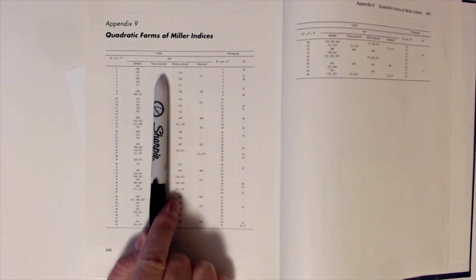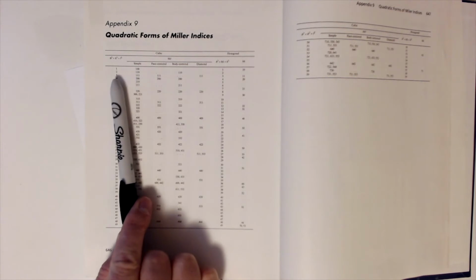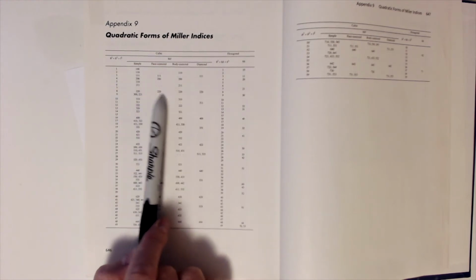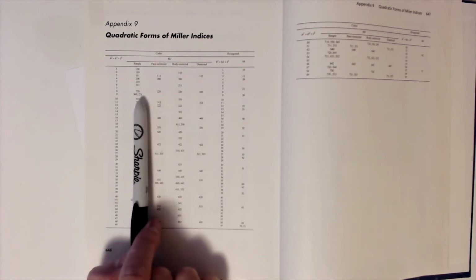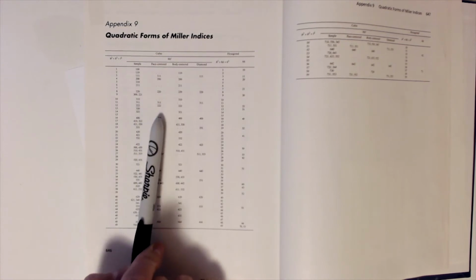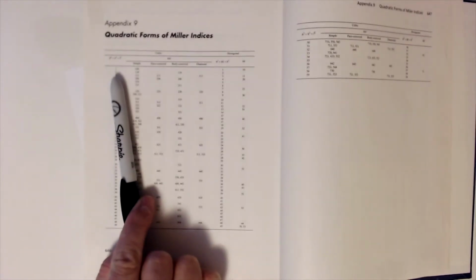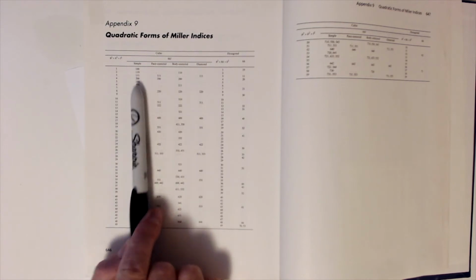However, if we get to face-centered cubic, you can see there are gaps here. The first one is actually 111, which has an S value of 3. Then the second one, 200, would be 4, and so on. The third one would be 8, and so forth, and we get the first 6. We would do the same thing for BCC. The first one is 110, and so that is 2. Then the second one is 200, which is 4, and we would keep getting our S values for that.